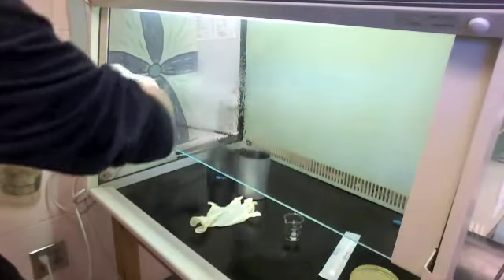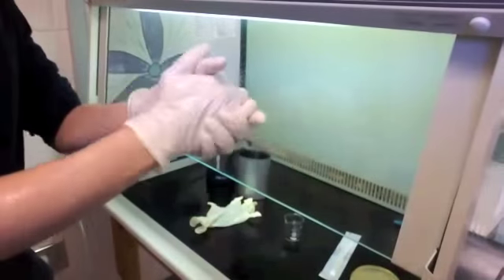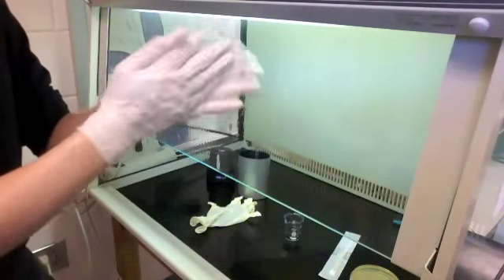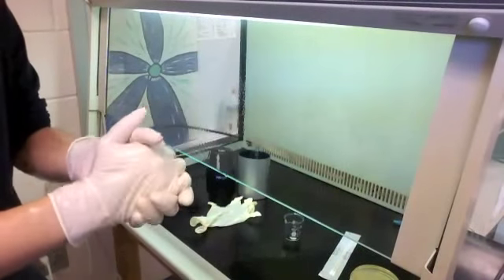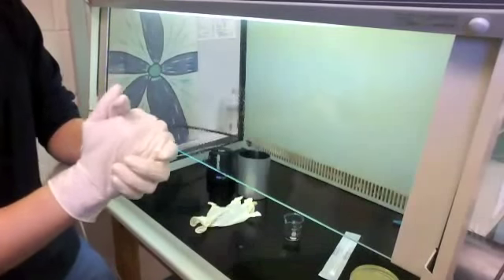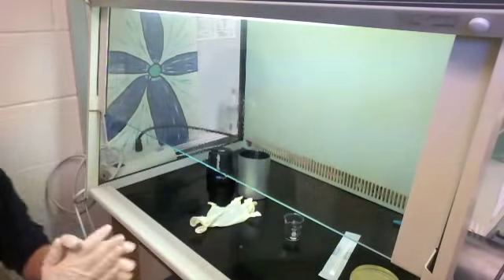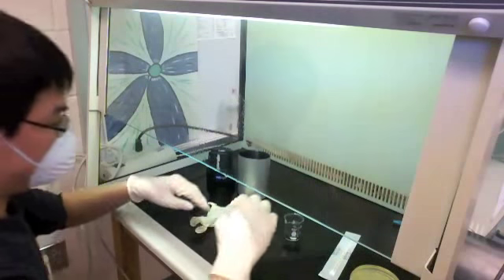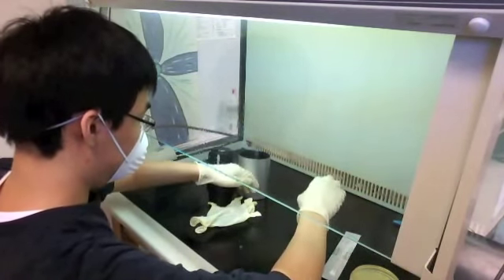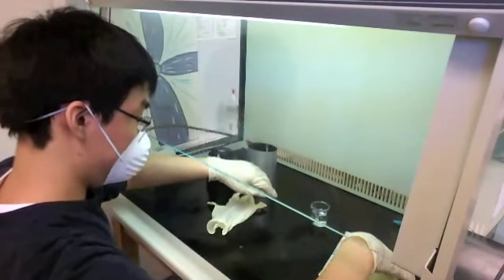I'm rubbing the alcohol in to make sure everything has an even coat and that germs on my hands and forearms are pretty much killed. Right now I'm mentally preparing myself, double-checking that I have everything I need inside the flow hood so I don't have to come back out. You'll notice my forearms and elbows never touch the table — that's standard procedure when you culture cells and bacteria.